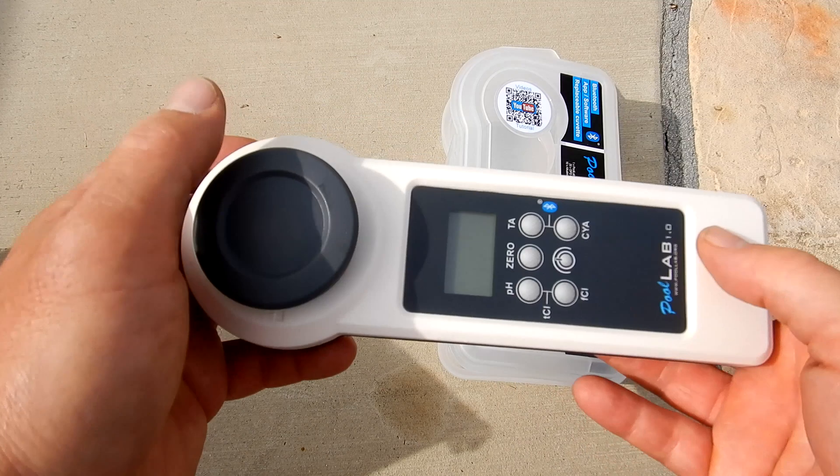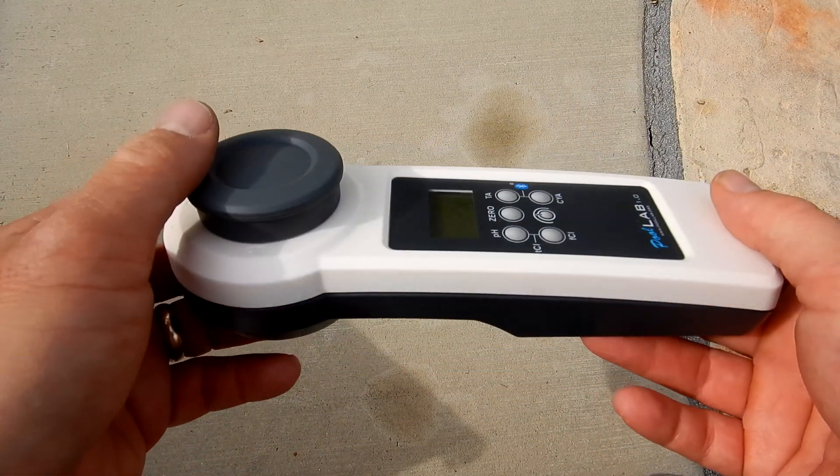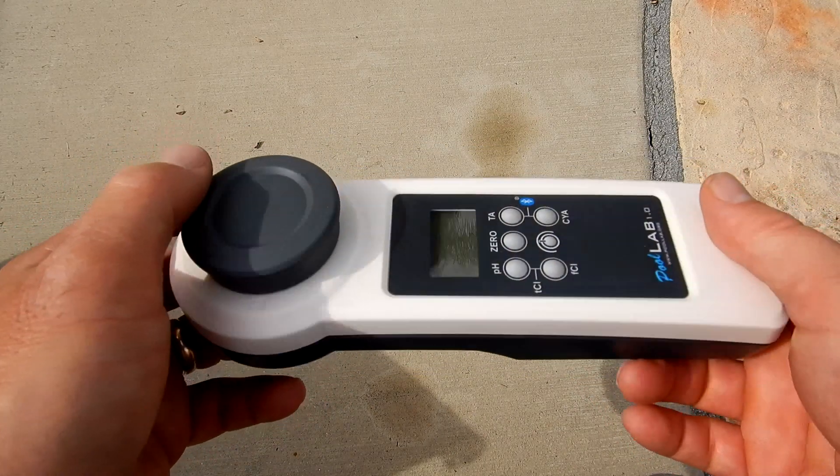Using a photometer tester takes all the guesswork out of getting the test factors for your pool and spa. This is the most accurate way to get a reading when testing your pool water. To see a full series of test factors with the PoolLab 1.0, watch the follow-up video.